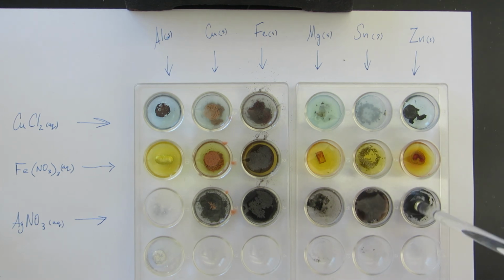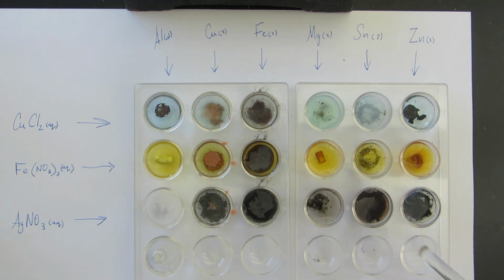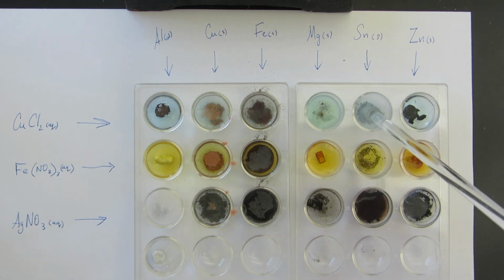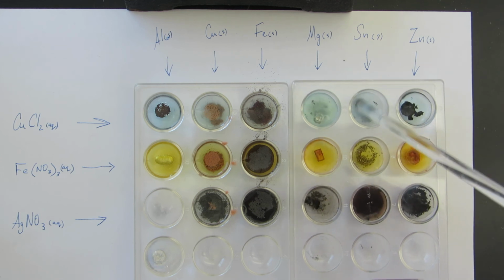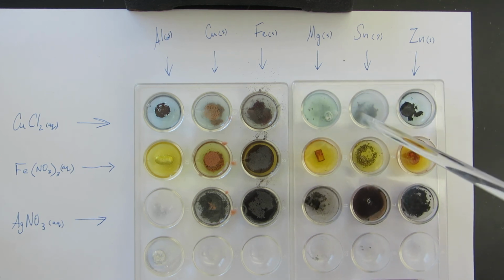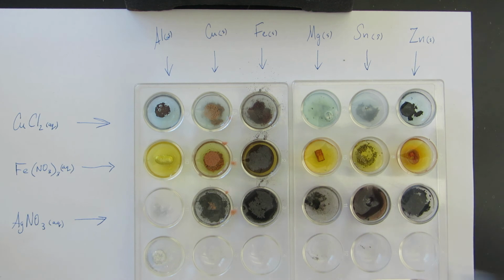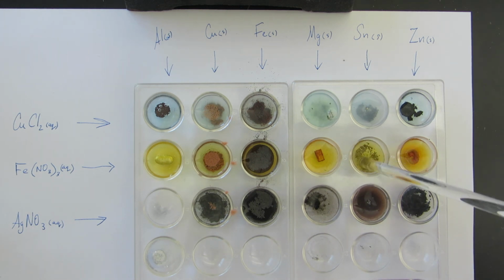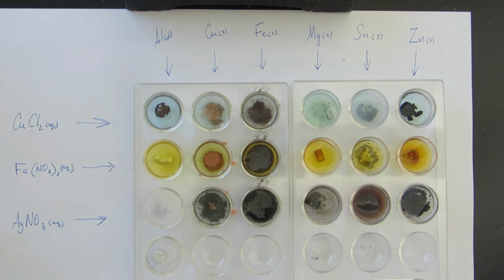Hey. All right, so got a lot of reactions going on. And tin. Tin reacts with copper, I would say. Oh no, yeah, that solution is definitely, it has lost its blue, so that is reacting. Tin's reacting with the silver for sure. And as far as the iron, I don't really see anything. I'll try to get a close-up, and then I'm going to turn this off. 10 minutes, that's way too long.